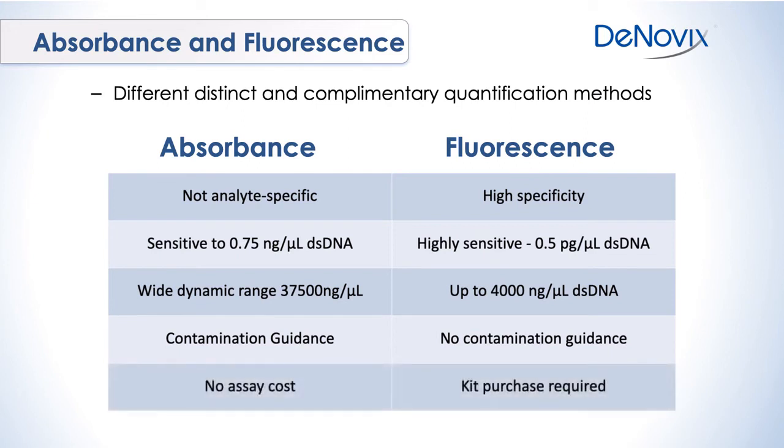And of course with absorbance we don't have any assay costs or any real time associated with setting up assays. And for fluorescence we need to purchase kits and we need to set up those kits. So there is a cost and a time factor involved in fluorescence.